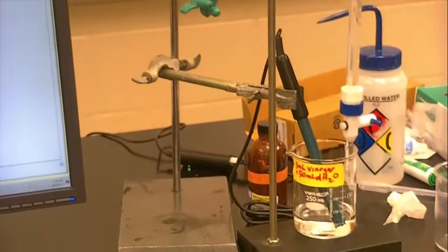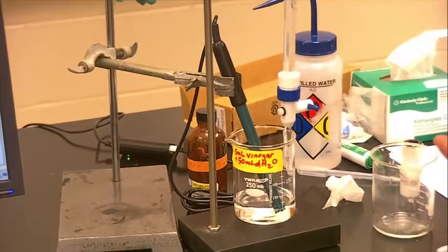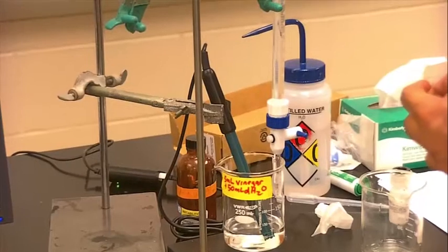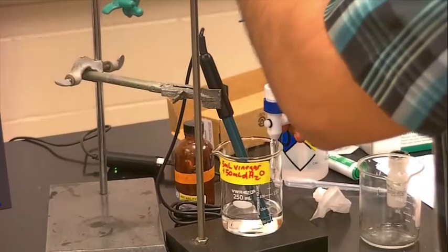So I'm going to add 1 mil at a time, okay? Make sure you read it to 2 decimal places. It doesn't have to be exactly 1.00. It could be 0.98, 1.02, whatever it is. All right, so here we go. So here is our first 1 mil.